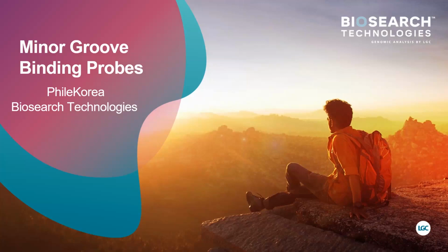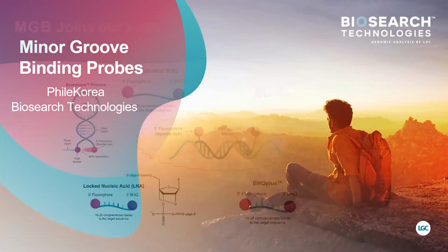So the main focus for today, we'll be talking about minor groove binding probes, or MGBs for short, as they have been proven to be a powerful tool. So I'll go on to the next slide.